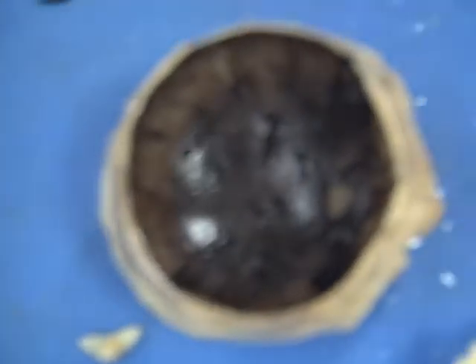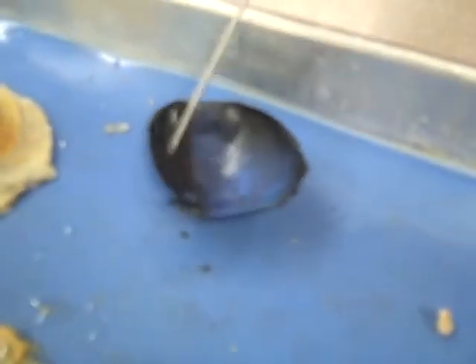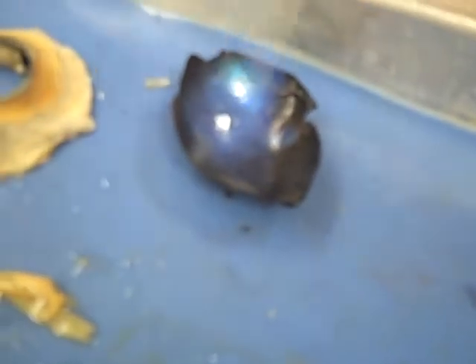We emptied it all out. This is the thing that reflects light, and that's how your eye glows sometimes in the dark — like, animal eyes glow in the dark with this, because it reflects light and it gets bright.